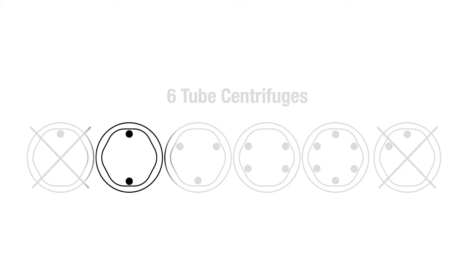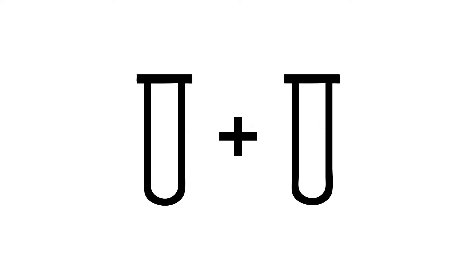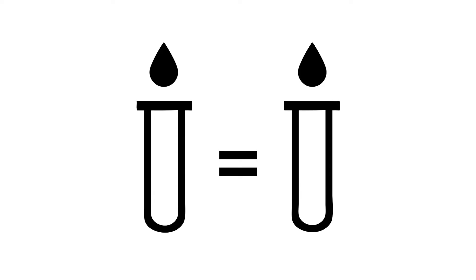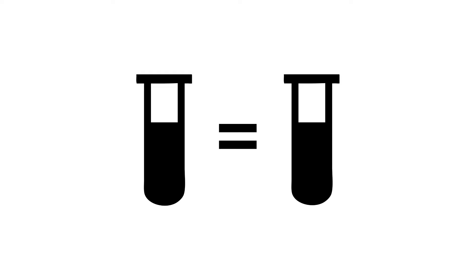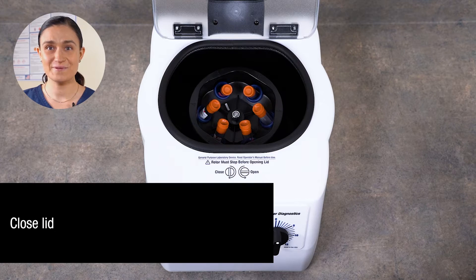So if we're loading two tubes, just put them across from each other. If it's three, make a triangle; four, a square, and so on. If you're spinning an odd number of tubes, you'll need a counterbalance tube. This should be an identical tube filled with an equivalent volume of water from the tube across from it. The counterbalance should be roughly the same weight as your filled tube. With your tube holders in place and your samples loaded and balanced, you're ready to spin.